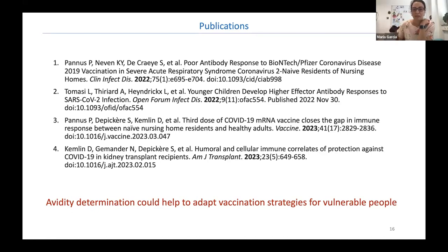Sorry about that. There was a telephone that couldn't stop ringing. No problem. So here's another question. What quality criteria for serum do you need to isolate IgG from the samples, and the quantity? Can you clarify what you mean by quality criteria for the serum? I'm not sure I can, because someone posted this in the Q&A. I would assume it probably means how much serum you need and when it was taken, so how long you are storing it and so on. Probably this person would need some explanation regarding the sample preparation, how complicated it is.